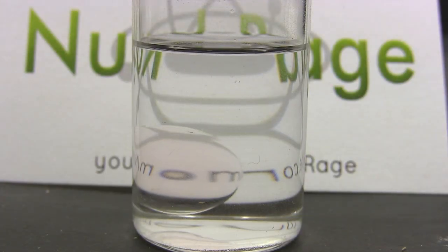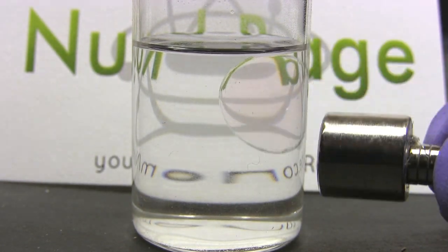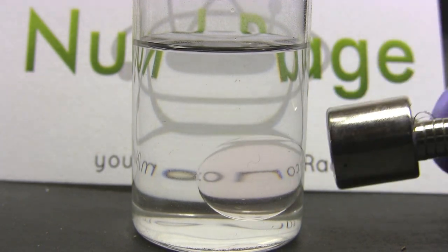And there we have it, a drop of paramagnetic fluid in a dichloromethane carrier fluid. We can clearly see it being attracted to the magnet.